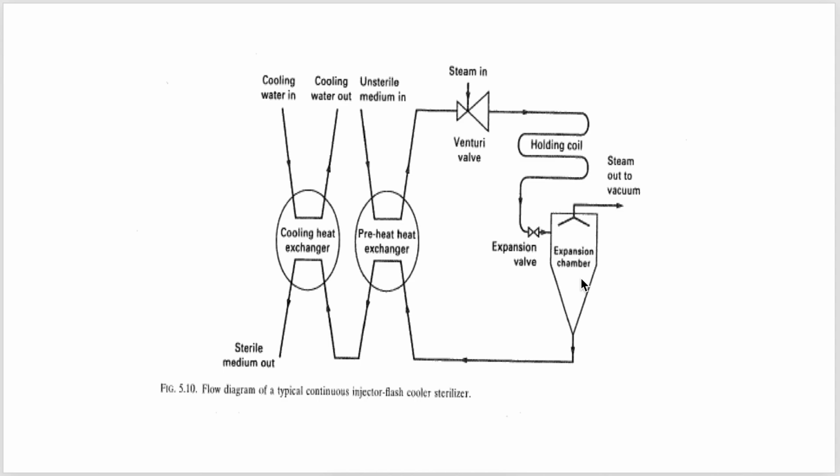This causes the expansion of the liquid media, and this heated liquid media will then rapidly release heat. That means it will rapidly get cooled. It will rapidly lose some heat, though that doesn't mean it will be completely cold. After this step the media is still kind of heated, so we pass it through the first heat exchanger, then the second heat exchanger, and in the second heat exchanger cold water is used to do the cooling.